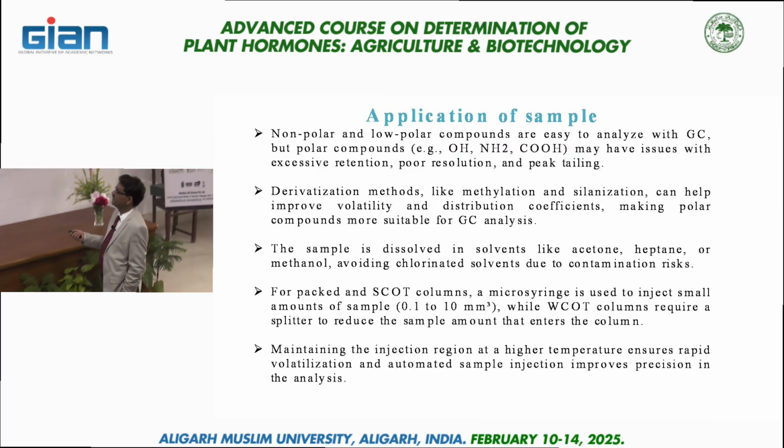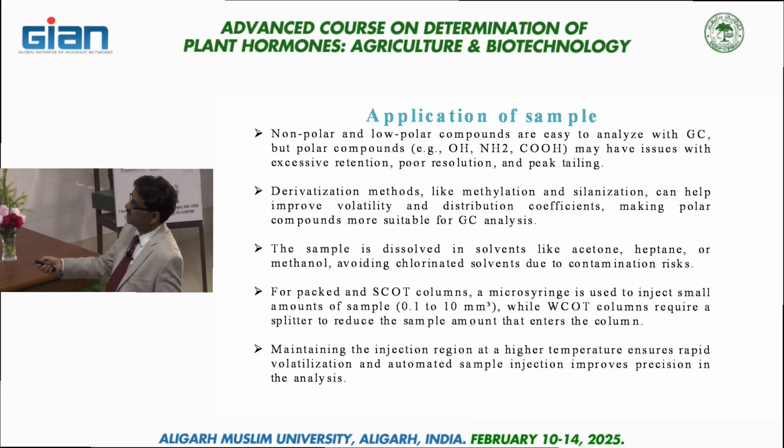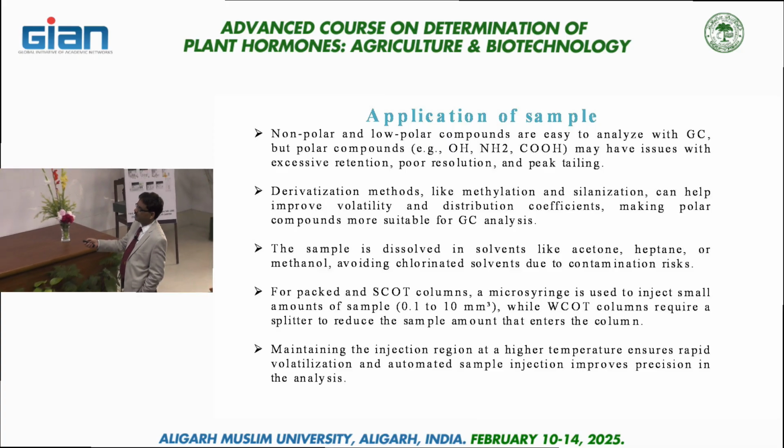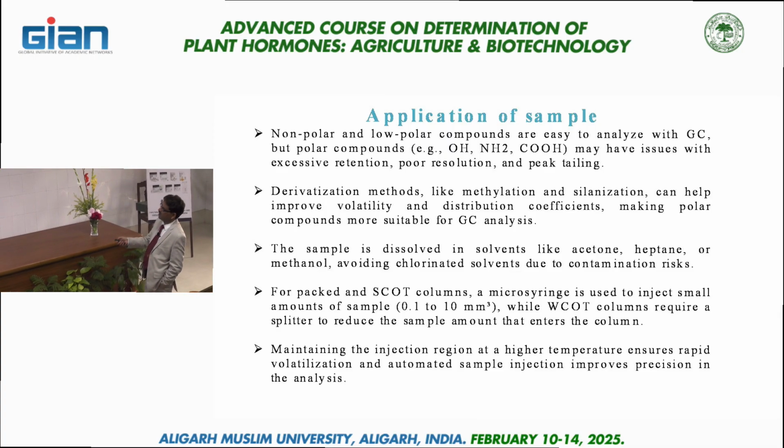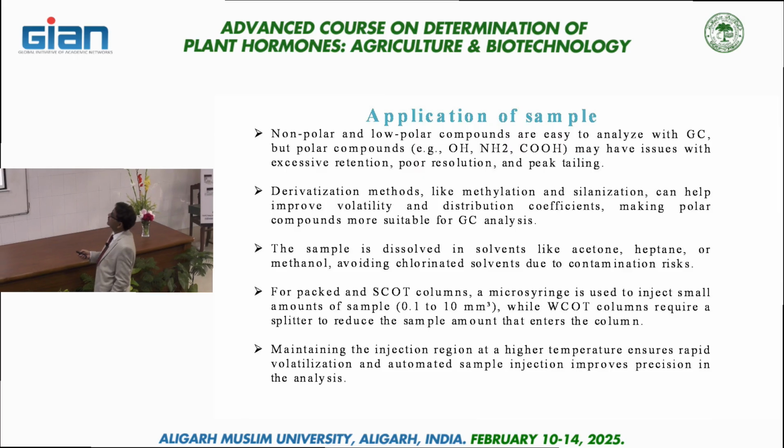The sample is dissolved in solvent. So that is your acetone, heptane, or methanol, avoiding chlorinated solvent due to the contamination risk. So these are some of the other points.